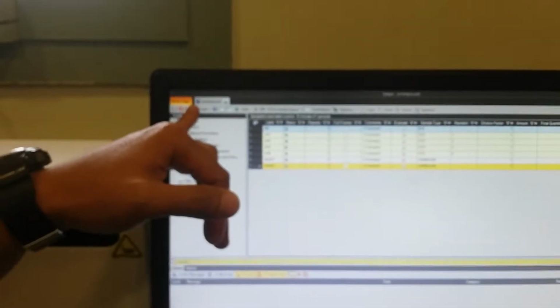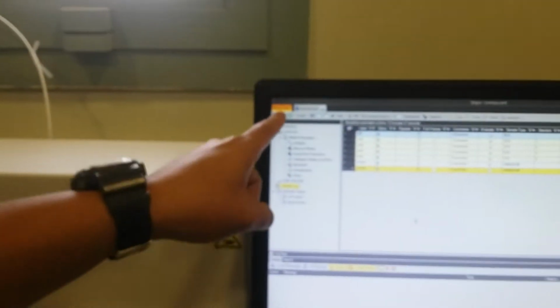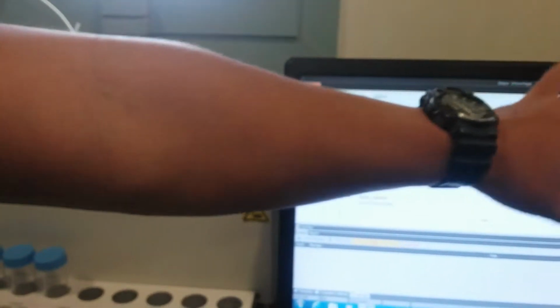Then we will click the start button. No, not yet. The plasma is not yet ignited. So you can close it also, because it's already saved. Now it's saved. It's ready here. We click on it, and later we will open. We put the samples now. If you click it, it will open the same one you did.